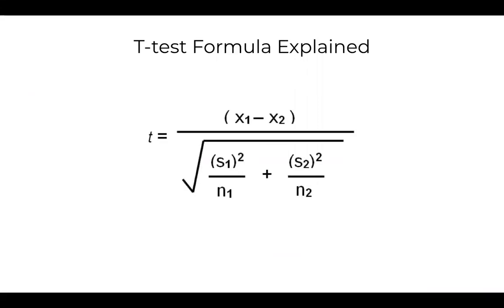In this case, we have two independent groups of samples, and an unpaired t-test can be used to determine whether the means are different for each gene.